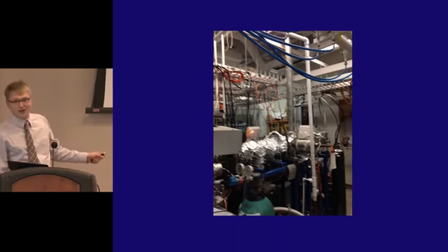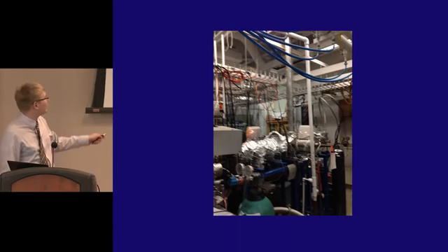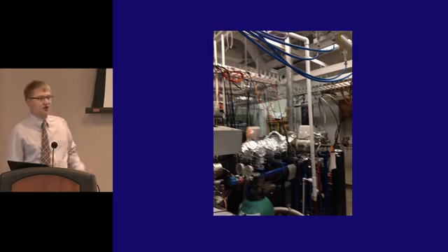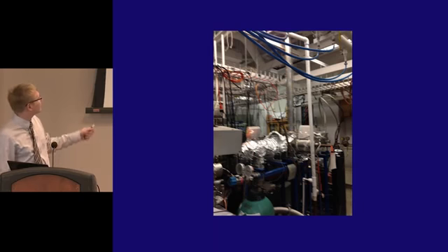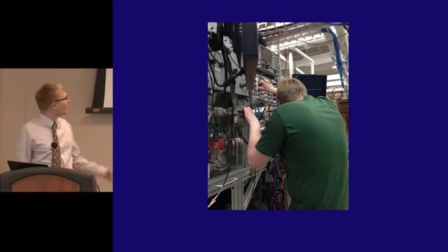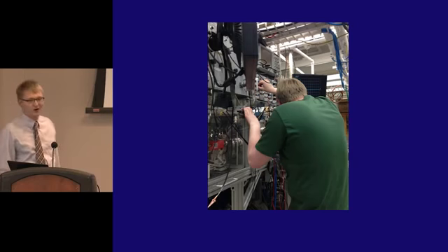And this is where the magic happens. This is the photoelectron spectrometer. This here is the magnetic bottle. It's about 6 feet tall, so as tall as I am. Sticks about 10 or so feet up into the air. And this is where we do the energy analysis and make the photoelectron spectrum. And here I am, hard at work, tuning up the beam power on our new source.